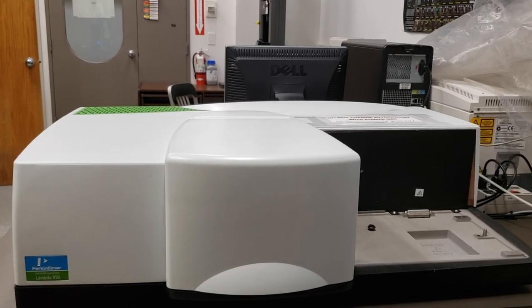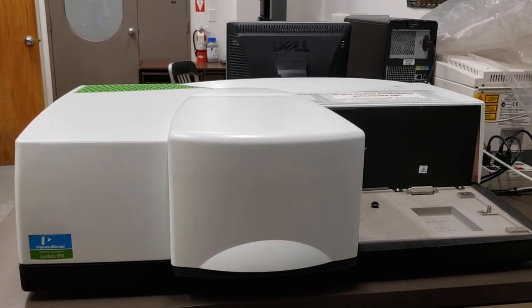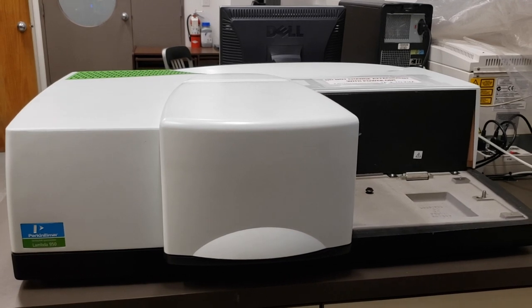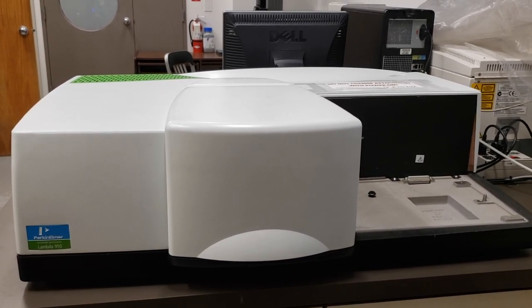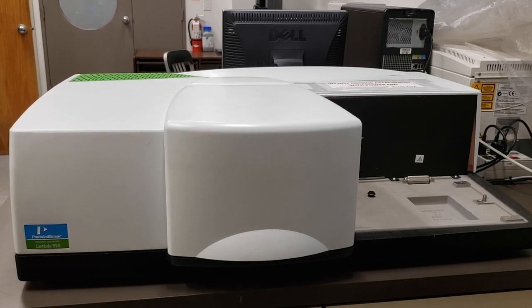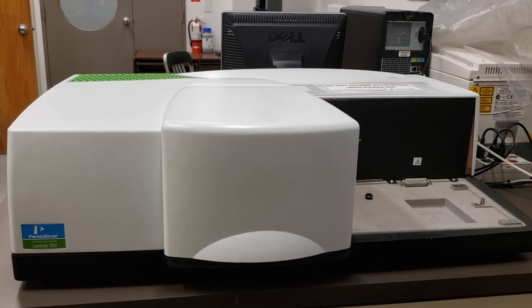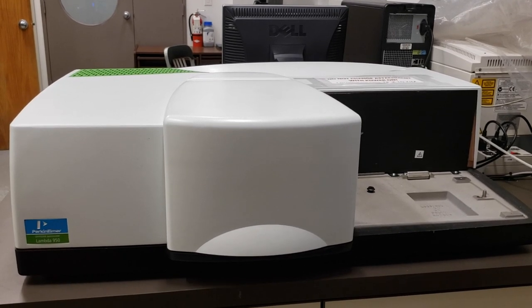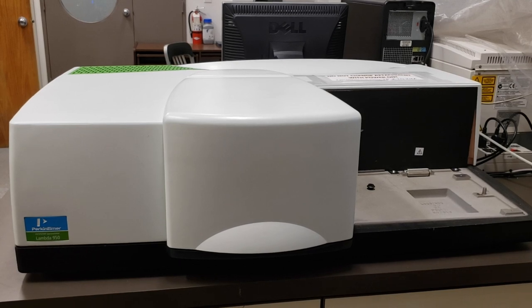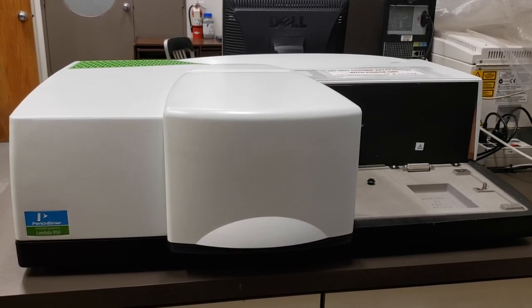This is the UV-Vis-NIR, which stands for ultraviolet-visible-near-infrared light. Depending on the detector you are using, this instrument has the capability to go all the way from approximately 150 or 200 nanometers up to 3300 nanometers — way up into the near-infrared region.